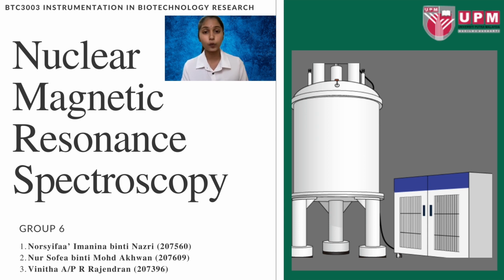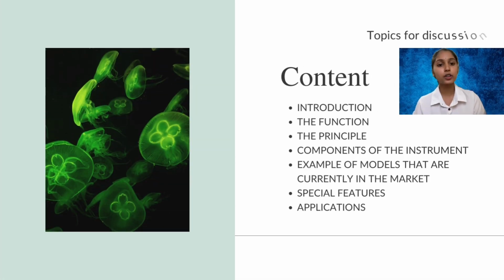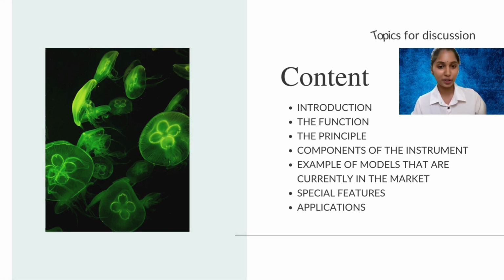In this video, we are going to present you a unique instrument, which is nuclear magnetic resonance (NMR) spectroscopy. Has anyone heard about it before? Yes, no? So let us share our knowledge about this instrument. Before that, our contents of discussion will be introduction, the function, principal components of the instrument, examples of models that are currently in the market, special features, and also application.